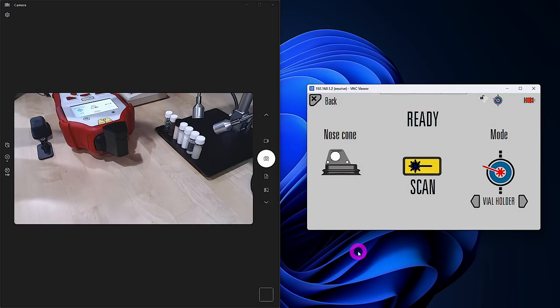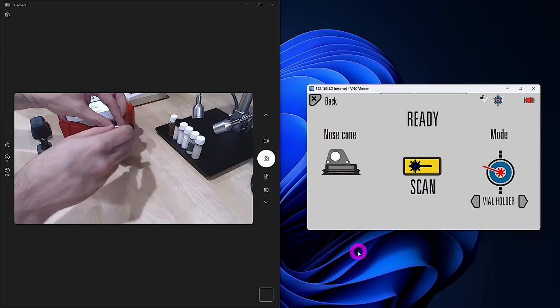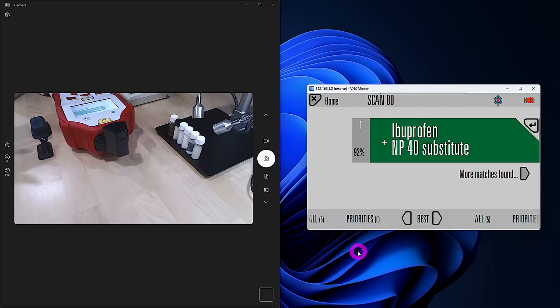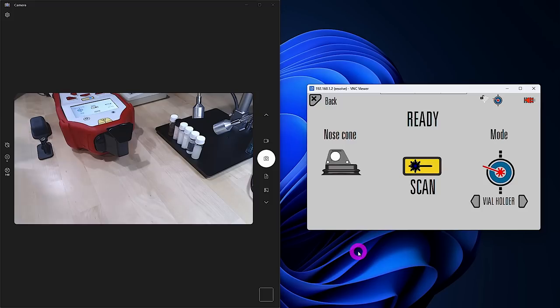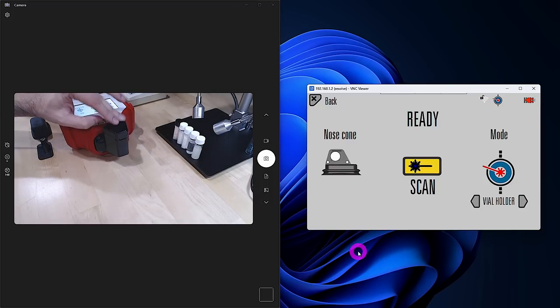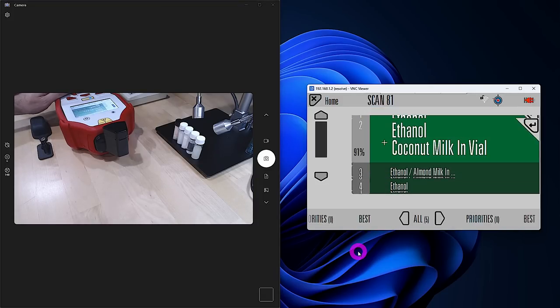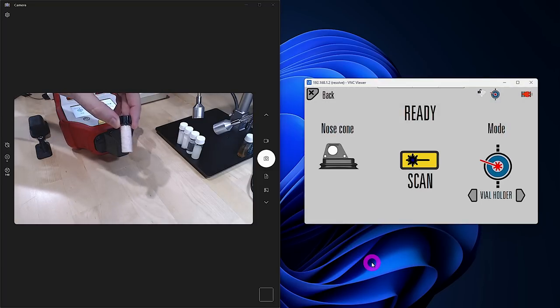Here are some prepared samples. First: Advil pills — the liquid inside the gel casing is the active ingredient. Let's put that in the vial holder and scan it. It tells us it is ibuprofen, among a few other things which are likely what the ibuprofen is dissolved in as well as the casing of the pill itself. Ibuprofen is the correct answer. And how about some mystery brown liquid? The instrument tells us it is ethanol as the primary ingredient — that's because it is beer. It detects the alcohol content and a whole bunch of other chemicals present in the beer. Let's also try these pink crystals next.